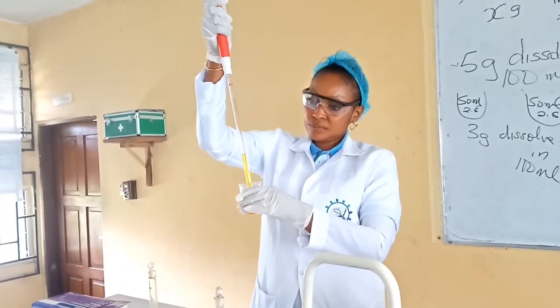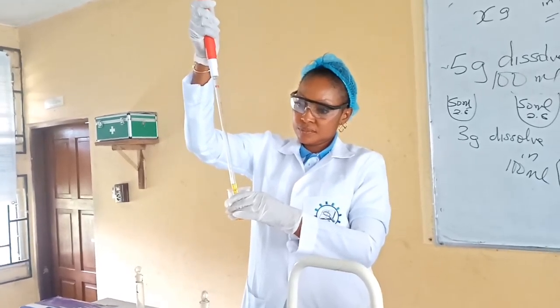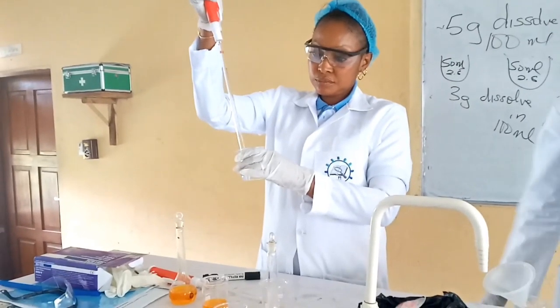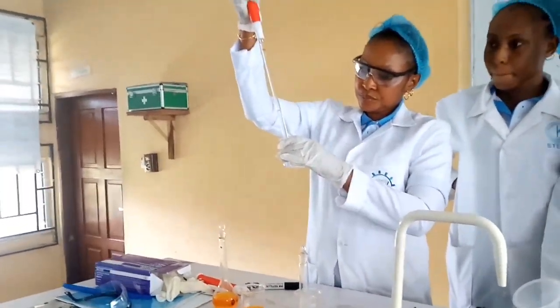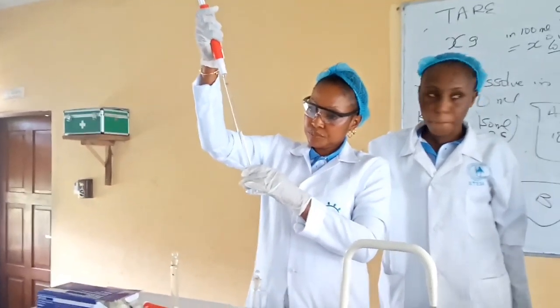So she has taken 10 mils. Are we together? Yes. Good. Now this one is just water, and she's going to add it to this one here. What do they call that one? Dilution. She has diluted.